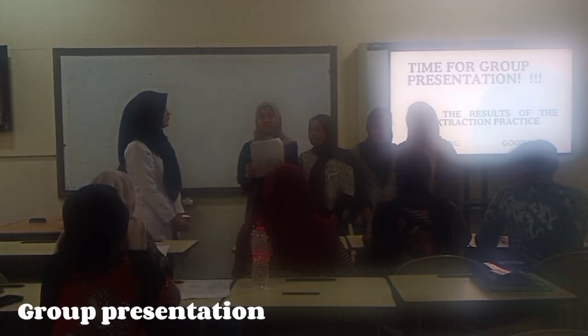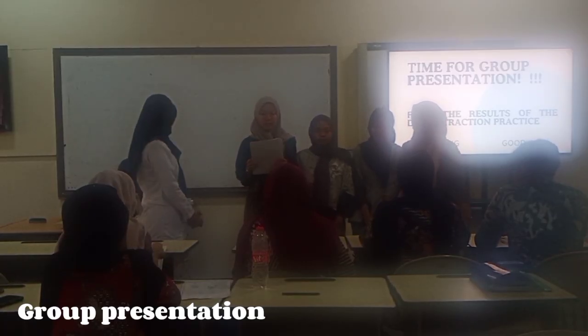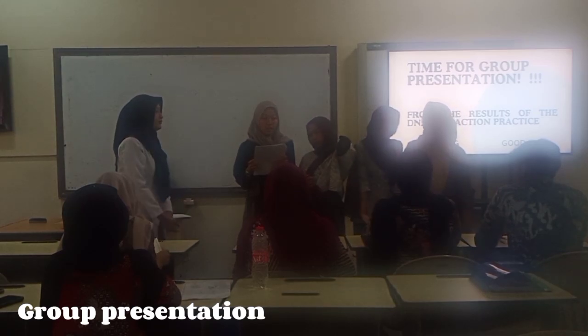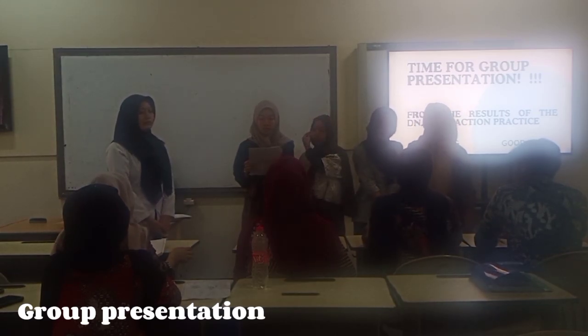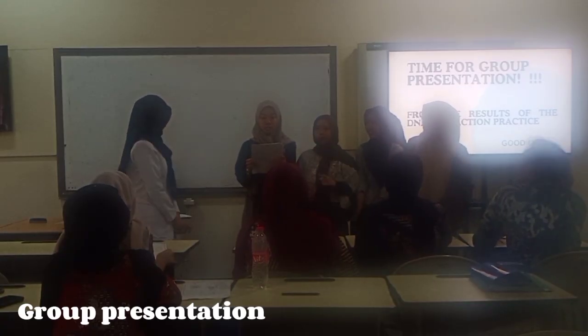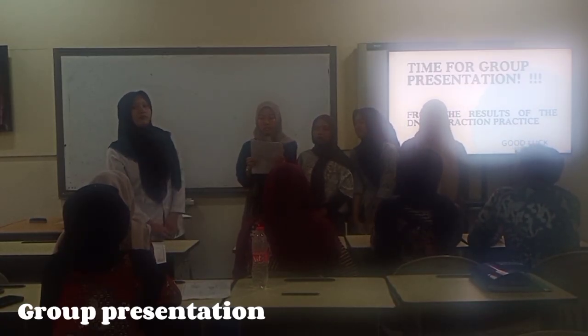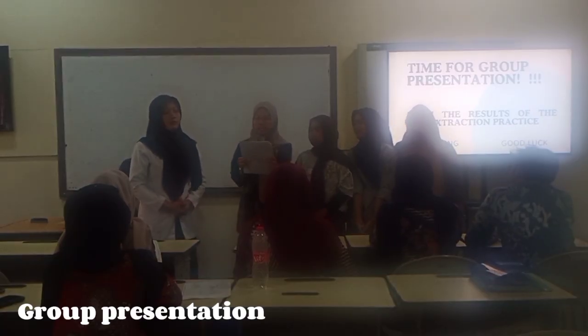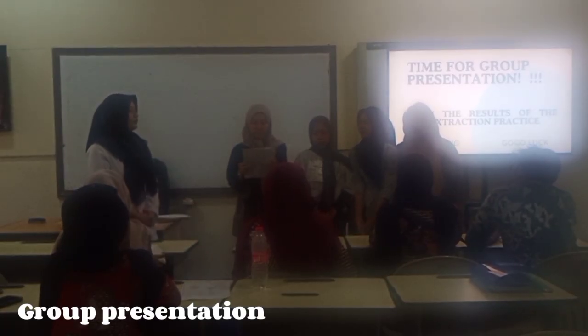Okay, everyone. We are from group 1 and our observation is that after adding the solution, the strawberry becomes mushy and the mixture turns foamy and salty. The salt and the solution broke open cell membranes, releasing DNA and other cell components.